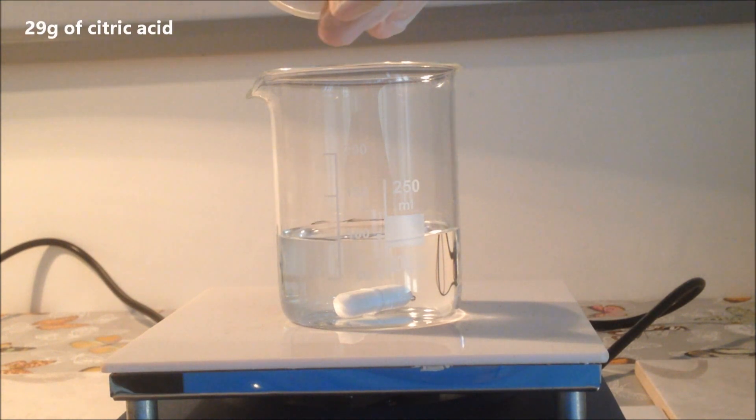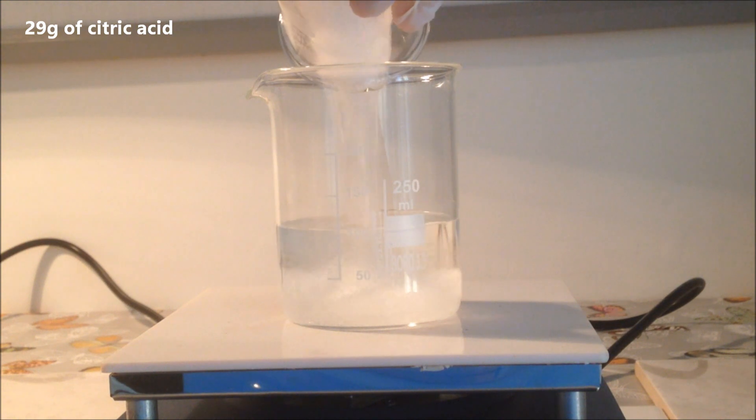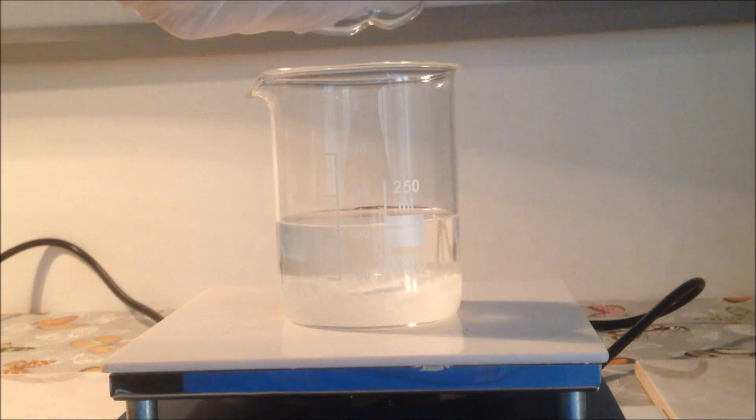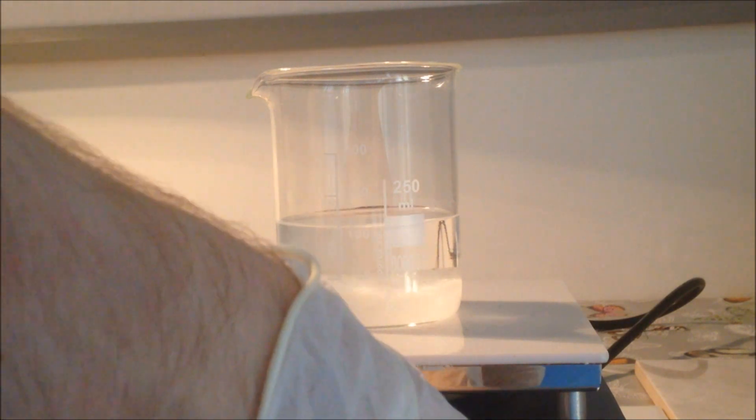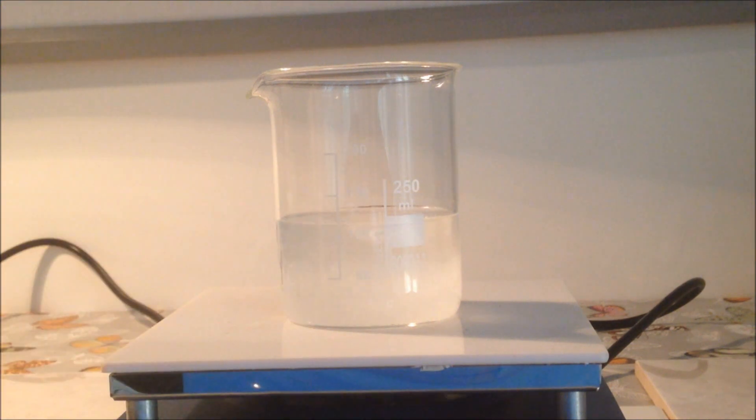I then added about 29g of citric acid, as this is the route I'm going by. I dumped that all in and turned on stirring to about medium to get that dissolved quickly before adding sodium hydrogen carbonate.